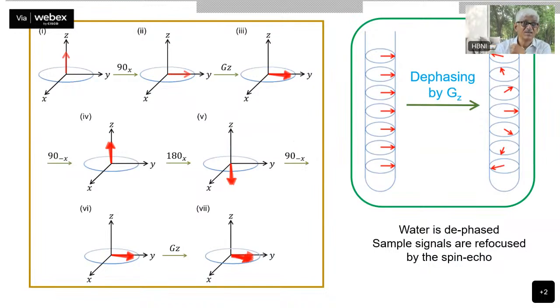dephases it further. It is not a refocusing here. So it is dephasing it further. Therefore, this will spread out over all the place. In fact, this will get spread out over the entire transverse plane. This is only showing a small portion of that here.